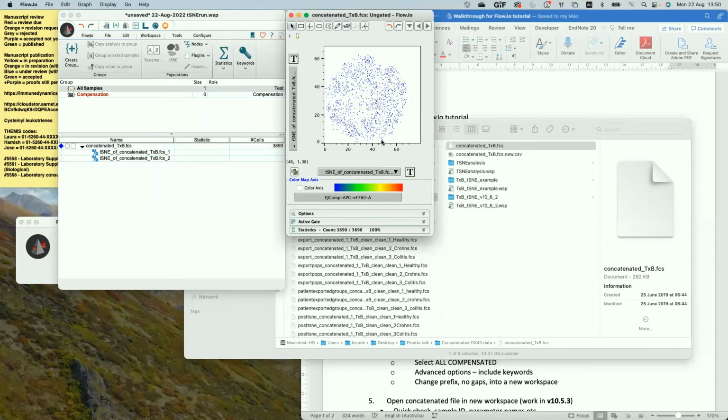So next we want to do some clustering analysis to figure out what unique biological data clusters might be in our data set. You want to be doing all this on your parent concatenated sample that includes all of your healthy and your disease and all your other cohorts, because it's taking all that into consideration when it does the clustering. Later you can manually separate and see if clusters are different between a control and a disease population or a treated sample or something.